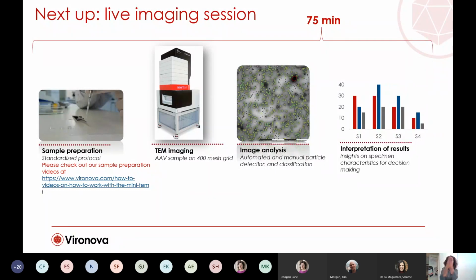From the very start to the finish of the session, or the entire process, should I say, from when you have a sample in a tube until you have your statistics and your data, should take 75 minutes. But I have done the sample preparation beforehand so that we can get started straight away. We have sent out a link where there are videos that show how the sample preparation is done. So please have a look at them. If you haven't looked at them now, you can have a look at them later. They are still on there.